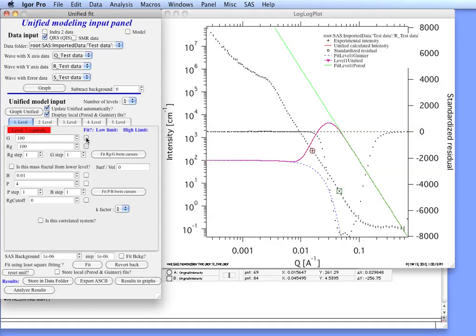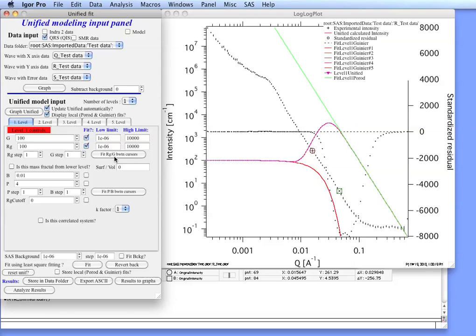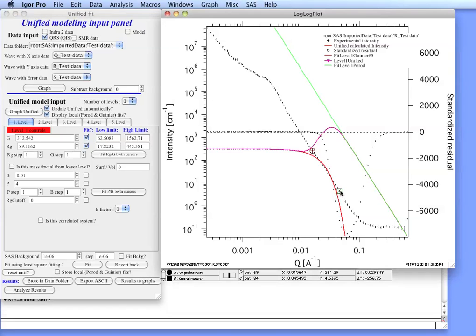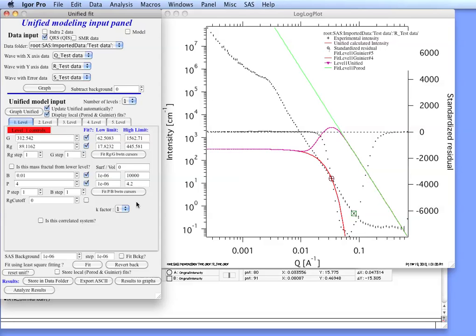Sorry, my computer is a bit slow now. Getting ahead of it. Okay. So we can now fit this. And you can see that now the Guinier fits nicely this area here. We then need to fit the power law slope which is currently out here. So we'll take the cursors and move them to the power law slope area. Again select the P and B and fit.